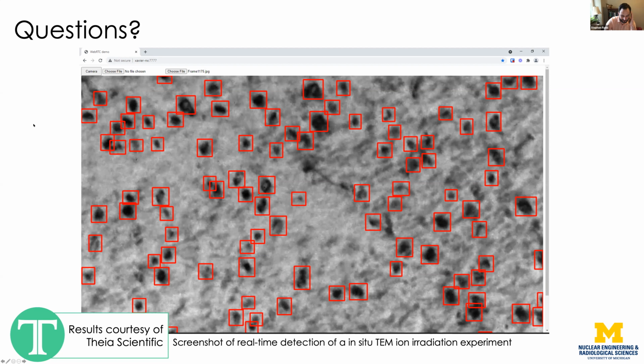So a few things I wanted to ask about, I probably won't ask them all. Do you look at the interactions of the dislocation loops and the precipitates? Yeah, that's actually in the terrible video that I showed. That's one of the things that we're trying to understand: if you have a precipitate sitting in the matrix, that precipitate has an interface, of course. That interface has an energy landscape that would absorb those defects. And so what we're trying to understand is how far do loops need to move in order to get there? How long does it take for that interaction to happen? All of those types of effects. So that's a project that one of my graduate students is actively working on at the moment.